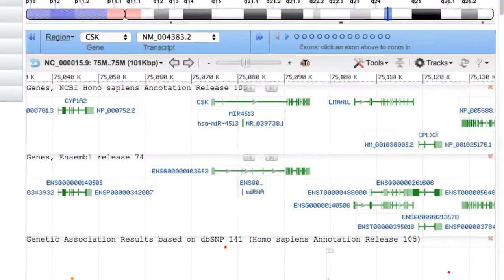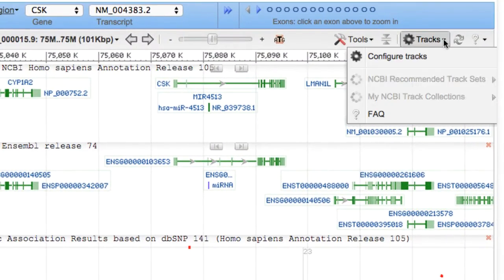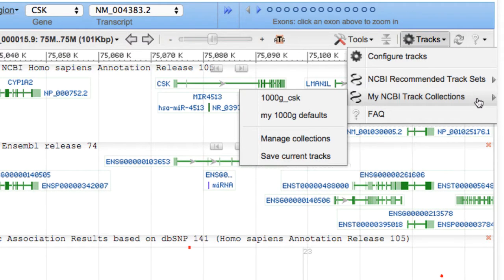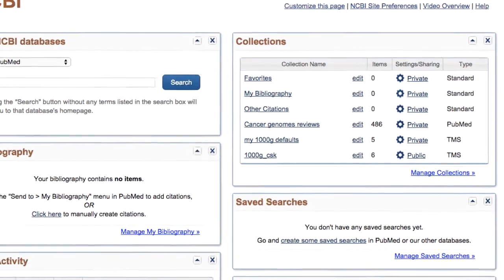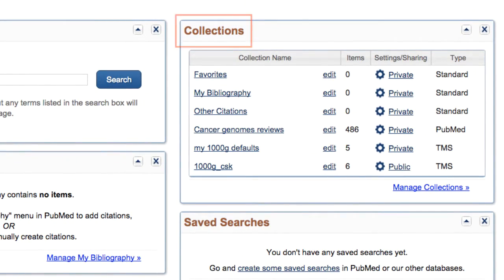This video introduces My NCBI Track Collections, a way to store, reuse, and share a set of tracks that you configure within one of NCBI's genome browsers. Track collections are stored in your My NCBI account, just like other collections, such as PubMed records.